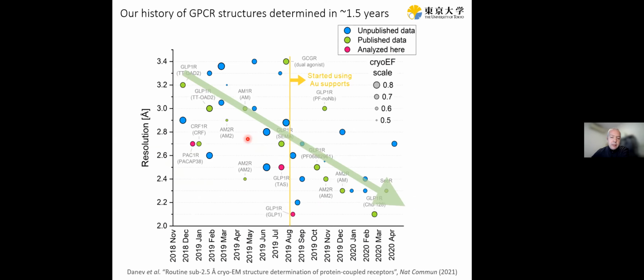And looking back at the plot of the reconstructions, we see the general tendency of resolution improving. So there was hope and enthusiasm: can we push things further? Can we go under the next psychological barrier, the 2.0 angstrom?